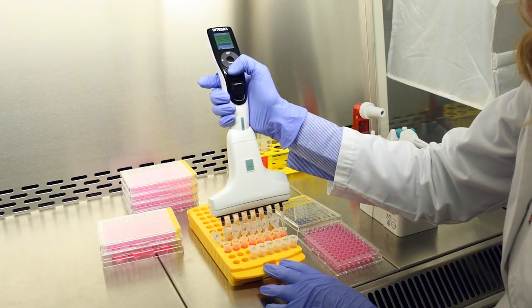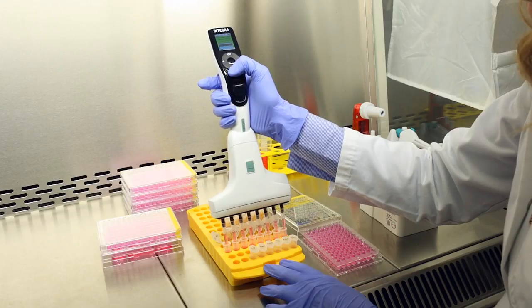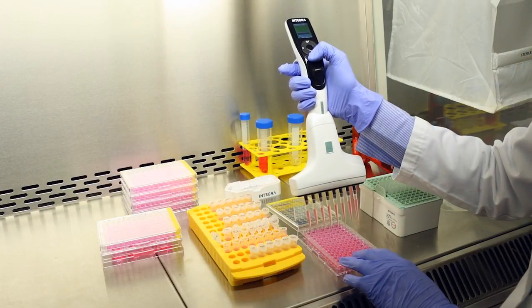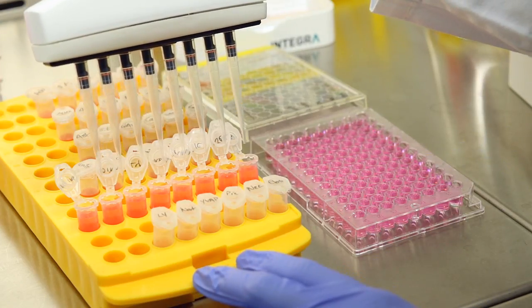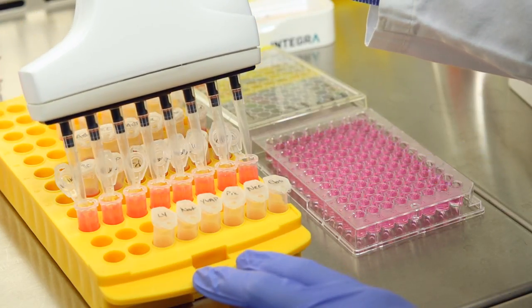The Integra Voyager, with its adjustable tip spacing, offers you a solution to these problems. By the touch of a button, you can match the spacing between the tips to any labware format.